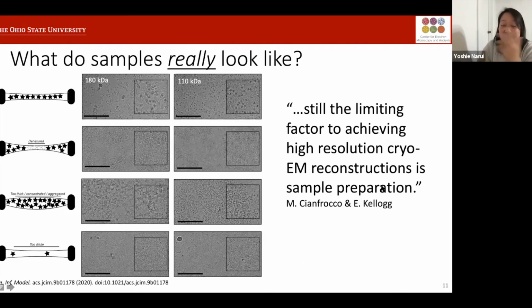So I pulled this quote from the reference here at the bottom, which is a very recent review article that just came out, and it says that still the limiting factor to achieving high resolution reconstructions is sample preparation. So getting a sample that is good enough to collect data.